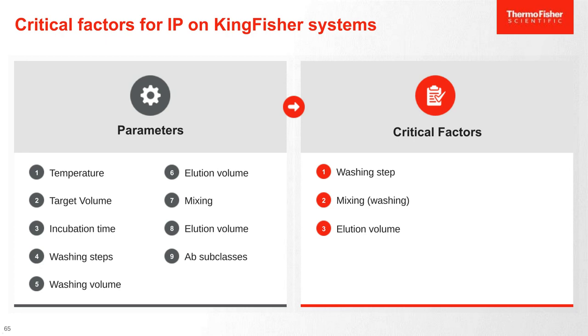For the final slides, I would just like to highlight a few data sets where we compared the automated workflow, the one that we have just optimized, testing all these different parameters, ending up with 3 critical ones.